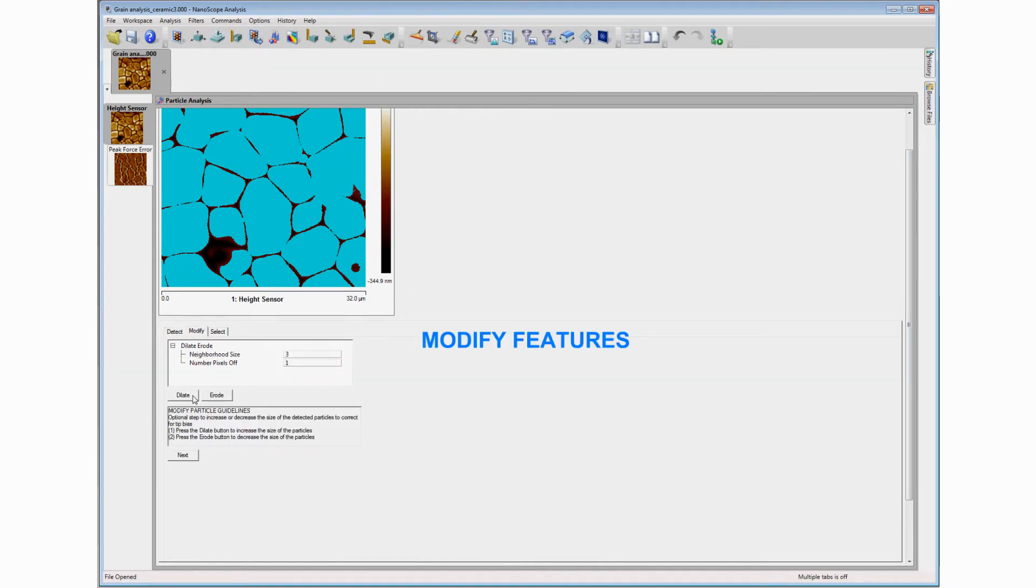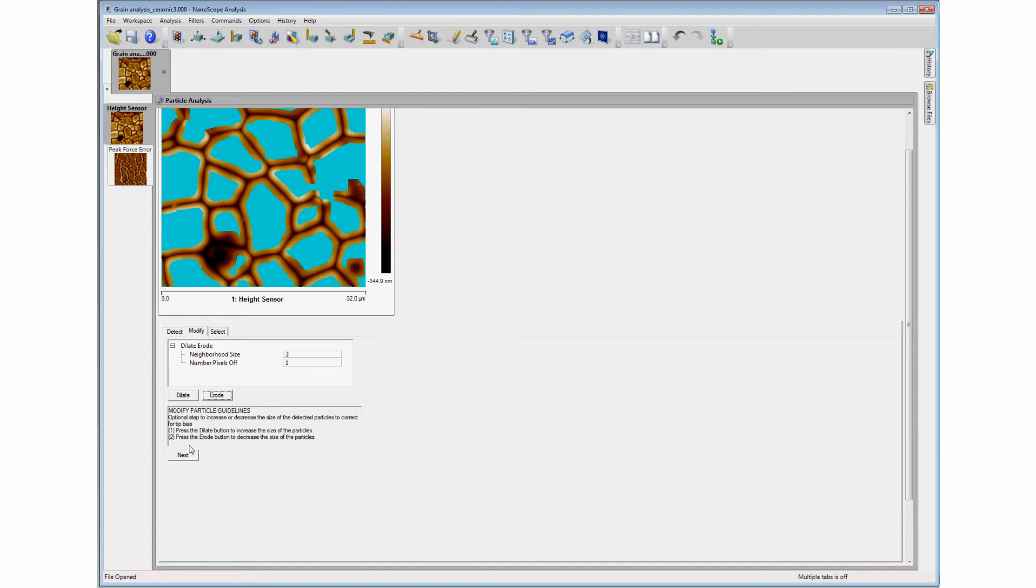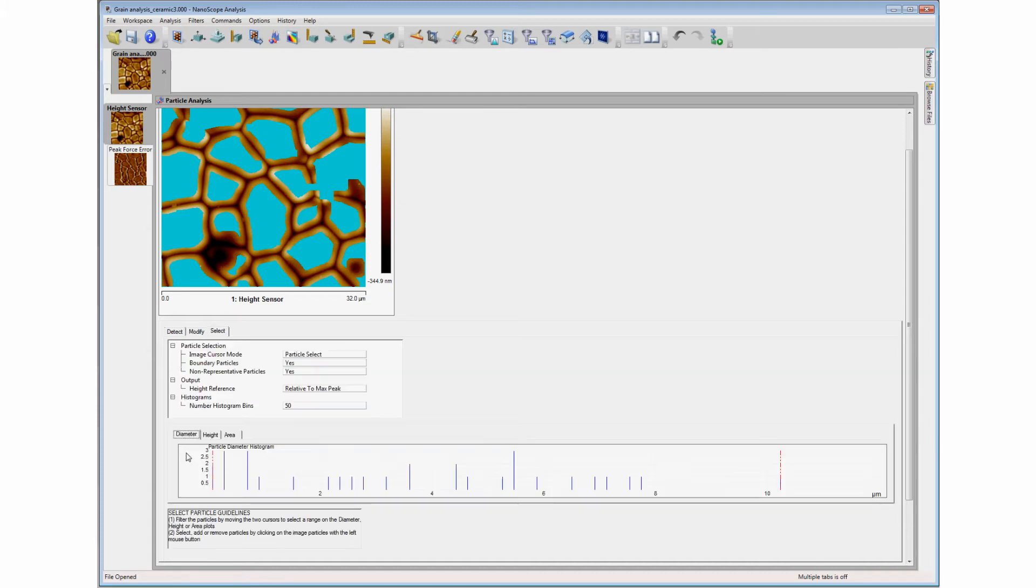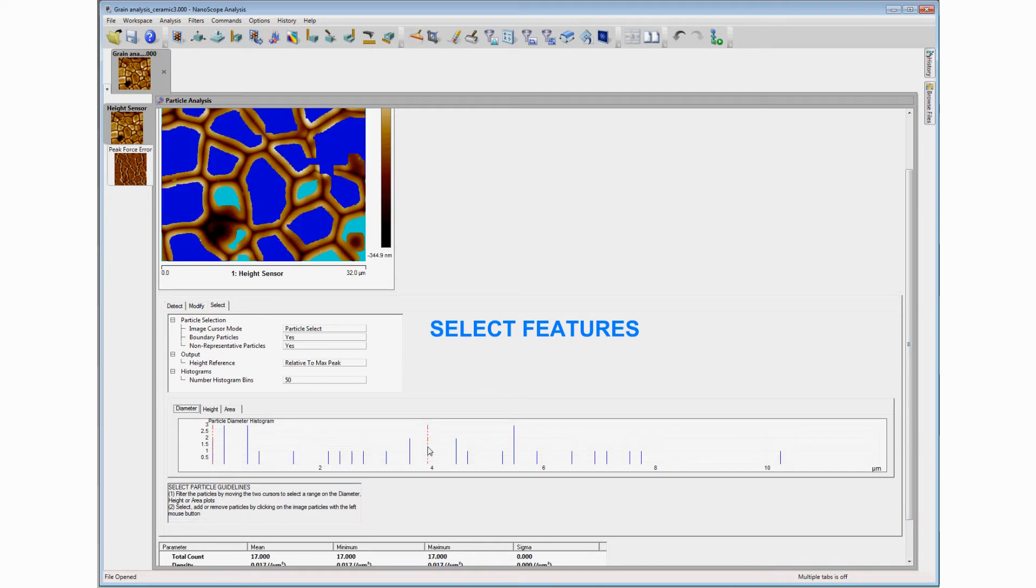The Modify tab allows the user to alter the selected feature dimensions. The Select tab limits the selection to features within the image boundaries or to count specific features.